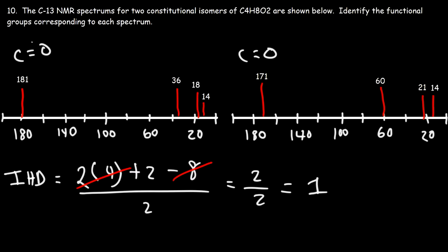So therefore, the carbonyl groups won't be shifted down by 10, as we saw if we attached them to a benzene ring in the last example. Now, for us to have, let's say, a ketone, the signal is usually around 210. For an aldehyde, it's close to 200. The signal at 180, this indicates a carboxylic acid. And the signal at 170, this is likely to be the ester.